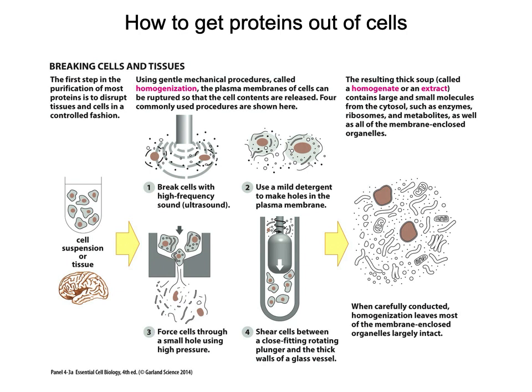So they do make disposable setups where you have this pestle and you put it into a microcentrifuge tube and you can grind it that way to help dissolve it. Usually you would also add a detergent to that, so it's a combination of the second method and the fourth method that allows for really breaking up those cells so that you get the homogenate.